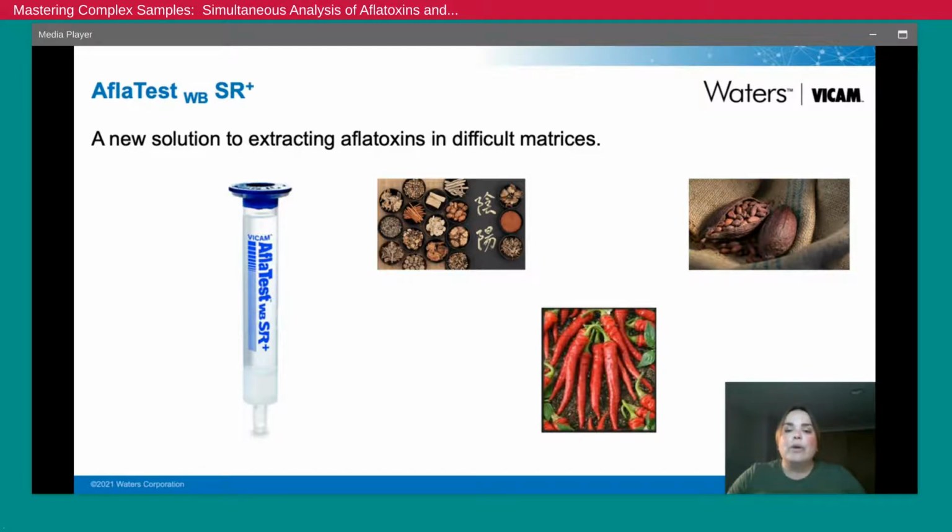Chromatographic separation was demonstrated using both the Waters HPLC Alliance and the Waters UPLC Acquity H-Class Plus platforms using fluorescence detection, supported with post-column derivatization and a large flow cell, respectively. The performance of the method was evaluated through replicate analysis of spiked test portions of 7 different matrices.